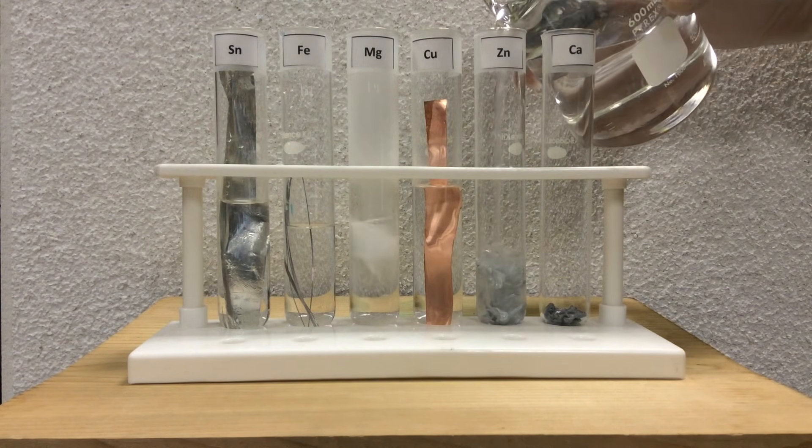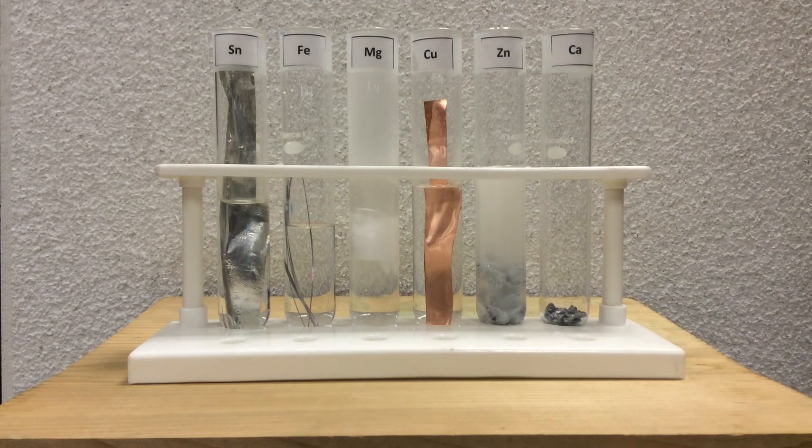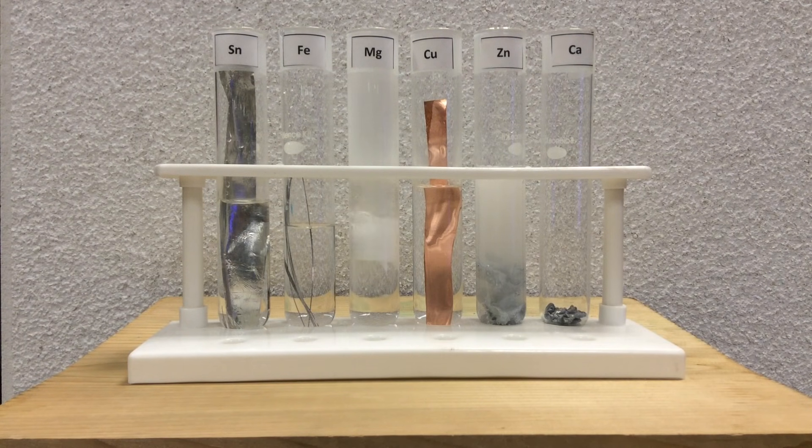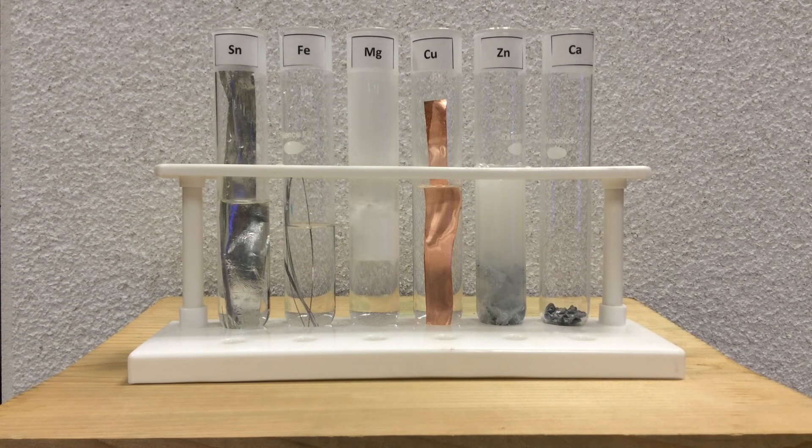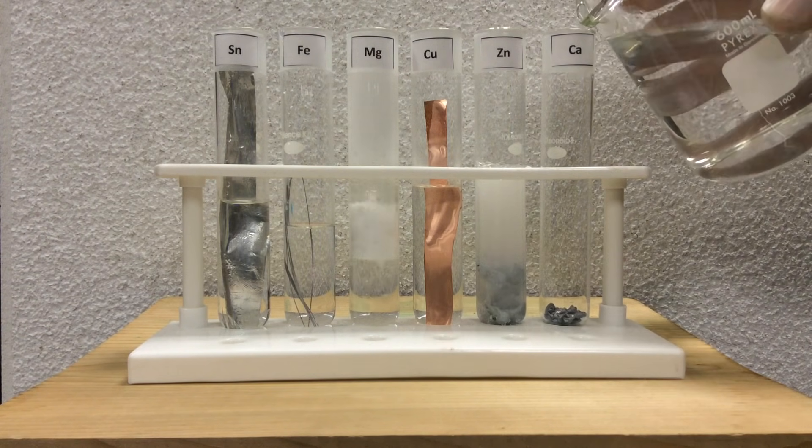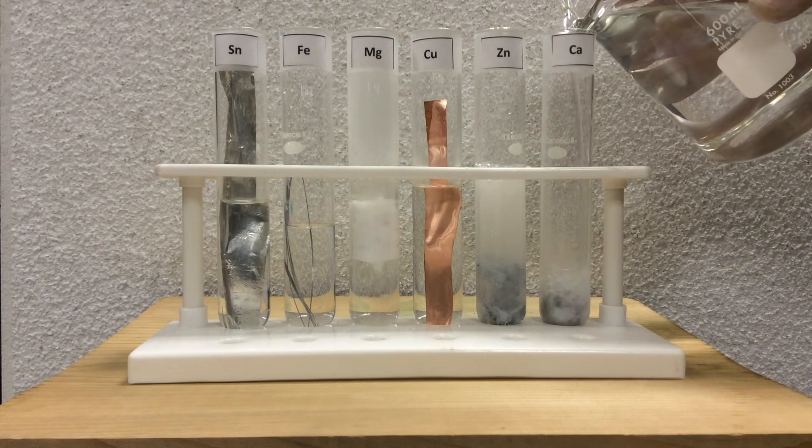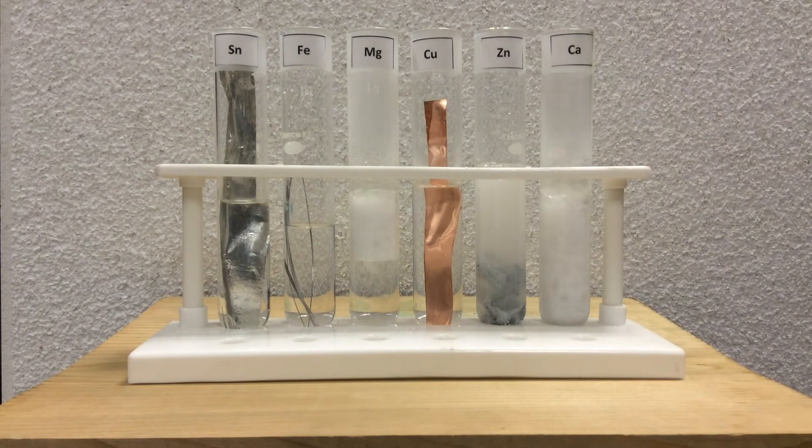And zinc as we add some hydrochloric acid. You can see some vigorous bubbles here. So the protons in the solution are being reduced by the metal who's giving it electrons. And now we can see calcium with the hydrochloric acid. The most vigorous of all.